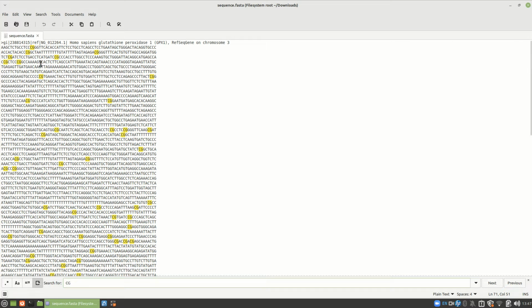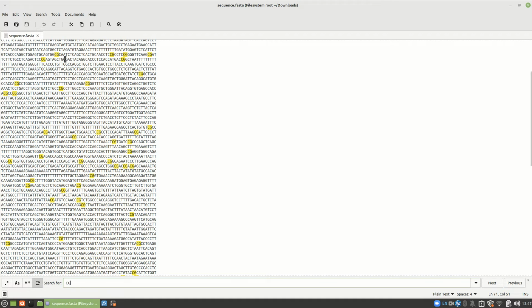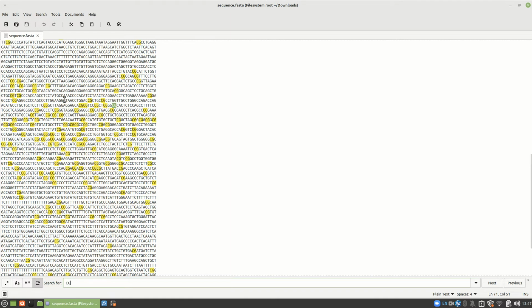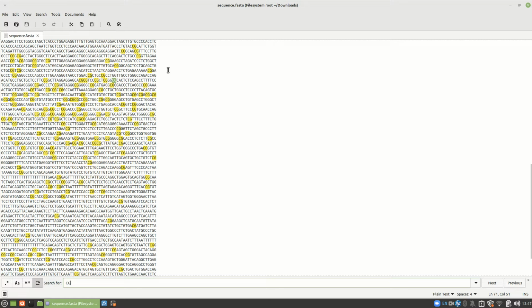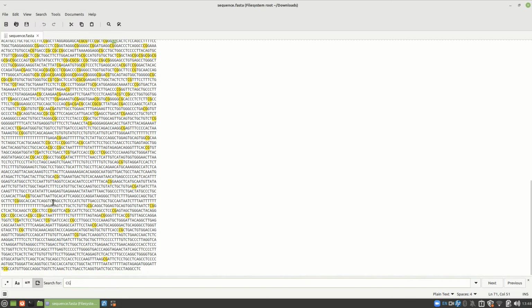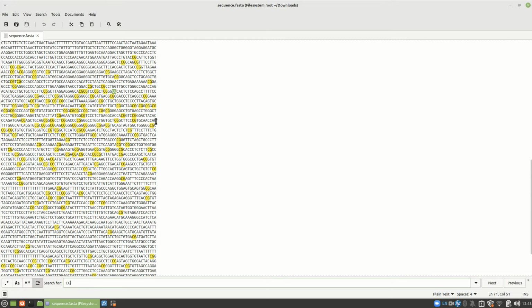We know there's a gene up here, but we don't know exactly where it is, but we might not have the complete sequence, the promoter sequence before that gene. But as we look through here, well, it's kind of randomly dispersed, as you can see. But then we get here. This is a CpG island, all right? You do not get that many C's followed by G's without being in a CpG island, all right? And I scroll down, there are a few more down here. But here is the beginning of your gene somewhere in this region.